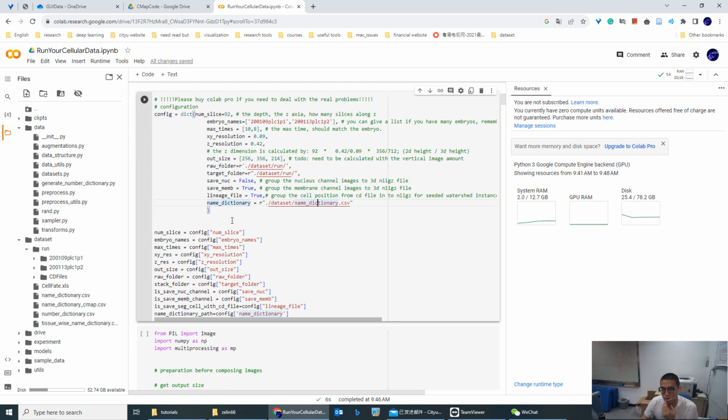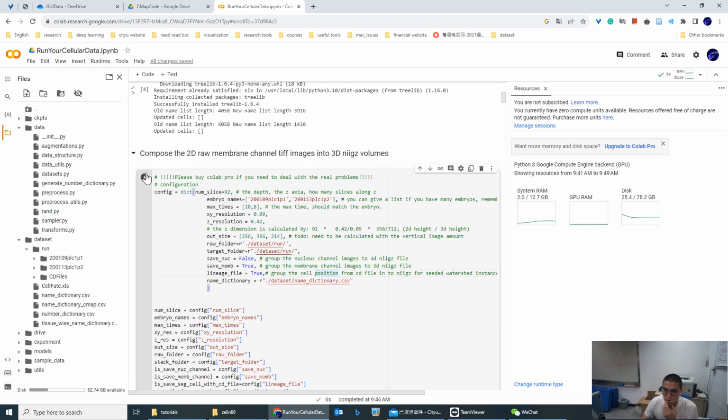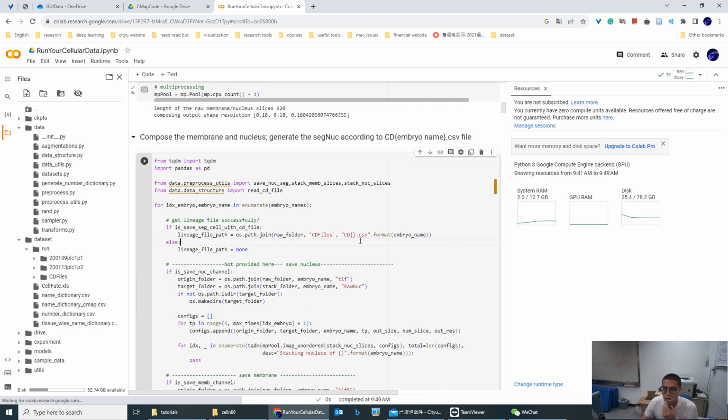It will be updated automatically, so don't worry about that. Now you click this block, and next one, and next one.